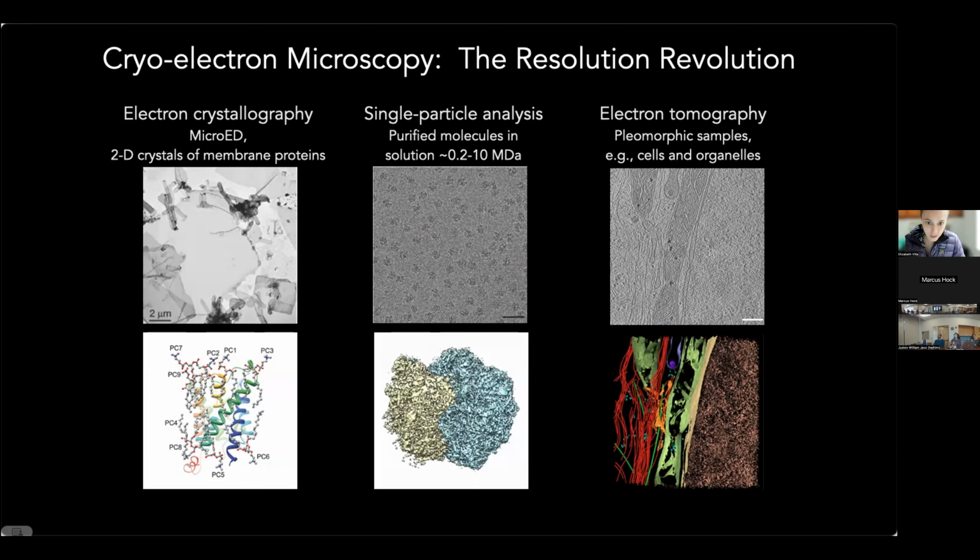And one image from a transmission electron microscope is literally the electrons that get transmitted. To a first approximation, it's proportional to the mass of the object. So the intensity of the pixels reflects high mass areas. Heavy atoms give you darker pixels and so forth.